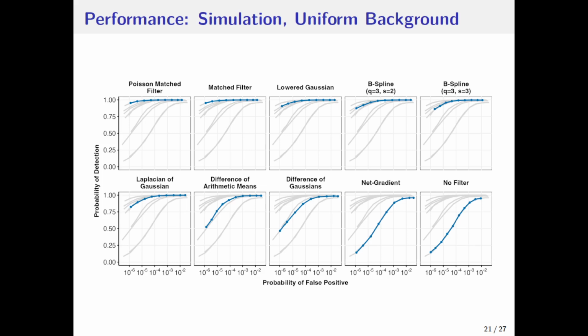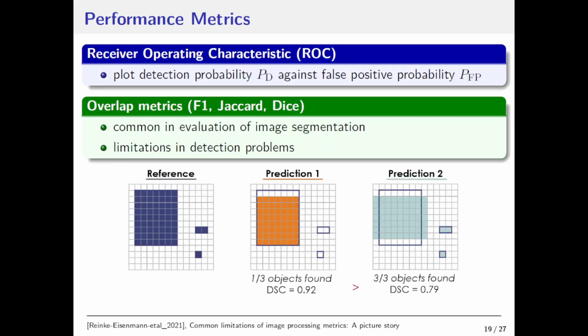And one more question on slide 19, if you can go. You have here those two possible predictions. Is it somehow possible to combine them and join together the advantages of both of those models? Yes. There exist AI algorithms called object detection that do both. They do image segmentation as well as detecting the objects, so they somewhat combine these two metrics.